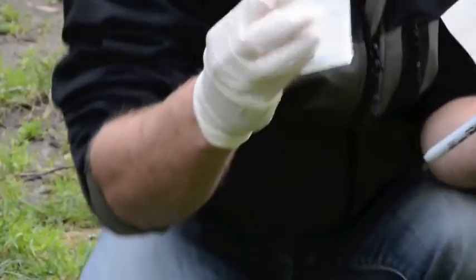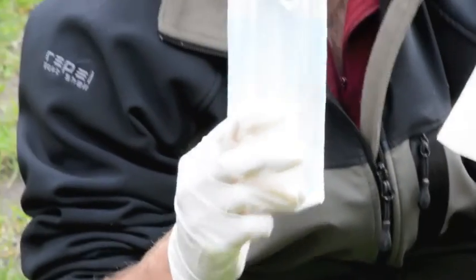We'll pop the filter back in its packaging to keep it as clean as possible for now. And finally, we grab a large gauge syringe to actually take the water sample. Okay, let's head down to the creek.